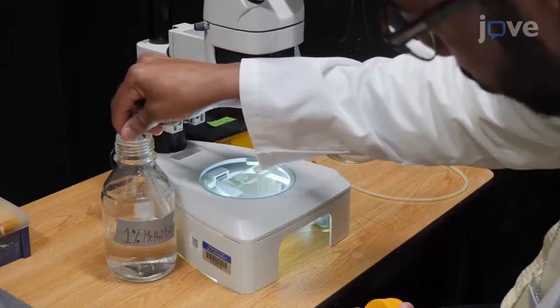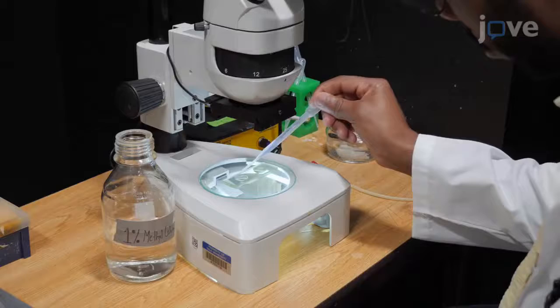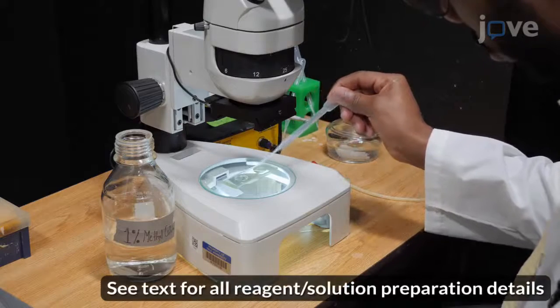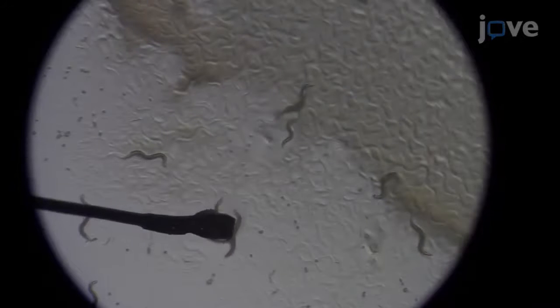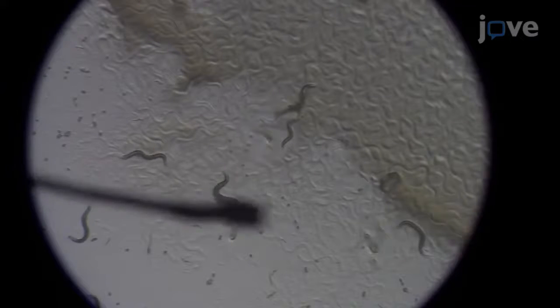Begin by adding 500 microliters of 1% methylcellulose solution into the depression of a concave microscope slide. Using a platinum wire pick, transfer adults from a nematode growth medium plate into the M9 methylcellulose solution.